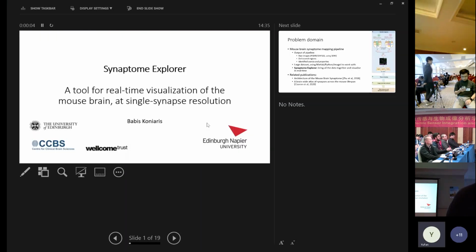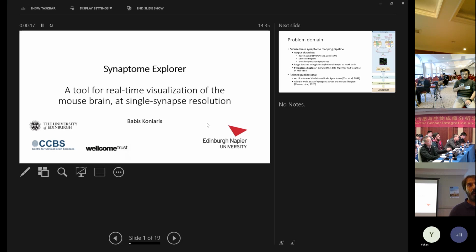Thank you very much. Right, hello, everybody. So I'm going to talk about a tool that I developed to help visualize the mouse brain or mouse brain sections at single synapse resolution. While I'm currently with Edinburgh Napier University, this was done while working with the University of Edinburgh at the Centre of Clinical Brain Sciences at the lab of Professor Seth Grant. And this work was funded, among other work, by the Wellcome Trust.